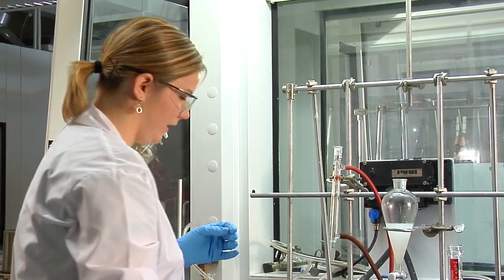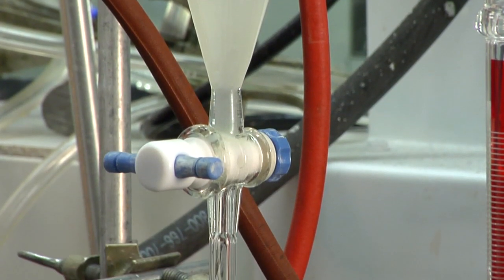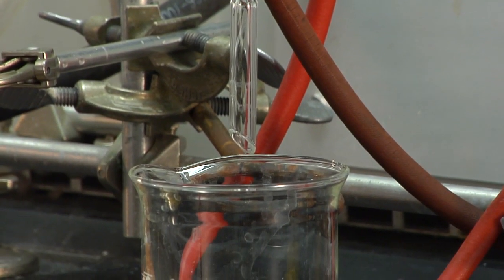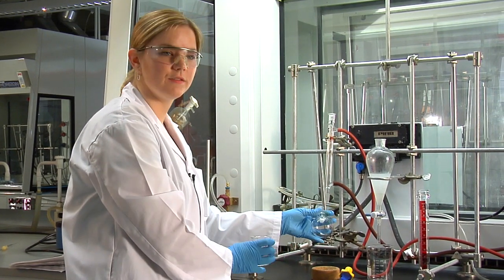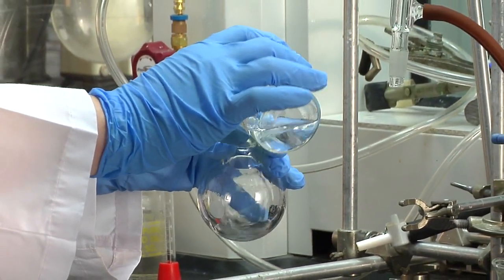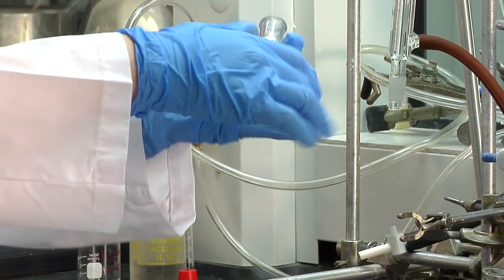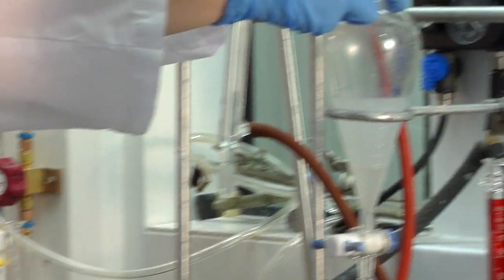And you'll see your two layers separating out, and then you're going to do your separation. So in order to make sure that we've transferred all of the product from the flask into the separatory funnel, we're just going to give the flask a little rinse with some extra ether. So I have 25 mils of ether here, so I'm going to add about half of it and just make sure that we get all the walls here, and we're going to transfer that in.